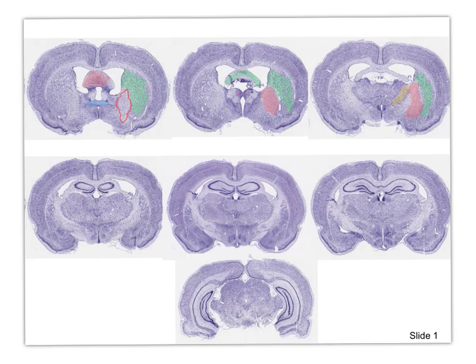Moving more posteriorly, we have caudate still. This is the caudal caudate, and just for your information, we're starting to get amygdala here, which is interesting. We've lost the globus pallidus at this level, but here we have the posterior limb of the internal capsule. There. So there is no GPI in rats, and that's the major difference that I wanted to talk about.